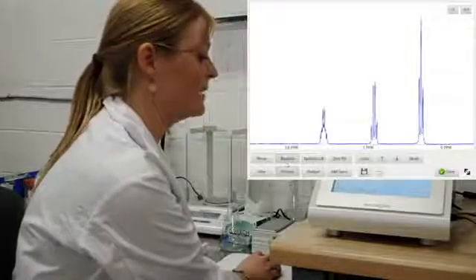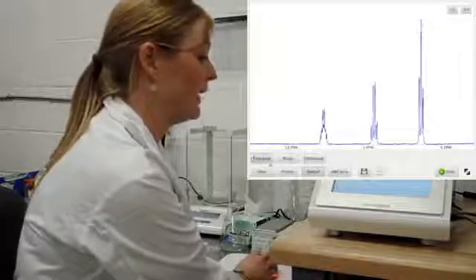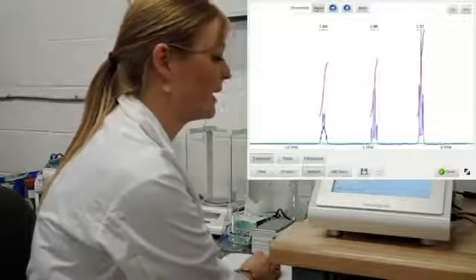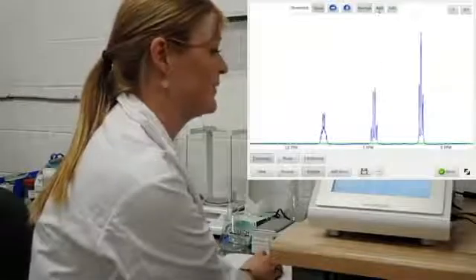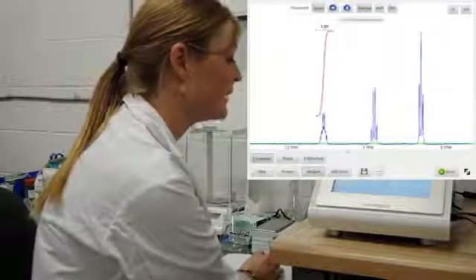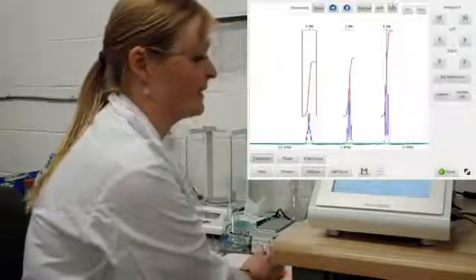When I'm happy with my phase, I'm going to click automatic, do a quick baseline correction, and then move forward to integration. You can use either an automatic threshold, which gives you a very quick integration, or you can set up the regions yourself. I'm going to click manual add, and I'm just going to select the areas that I'm interested in integrating. This is just a rough start for your integral regions, but they're very easy to edit as well.